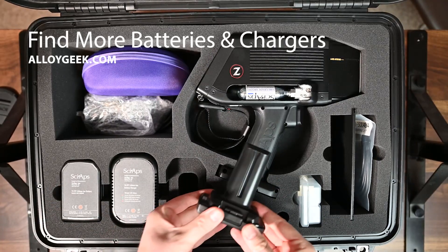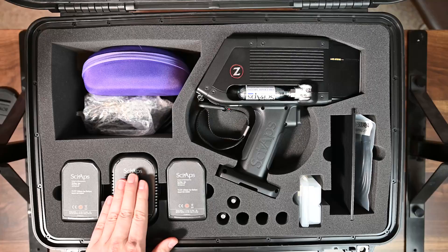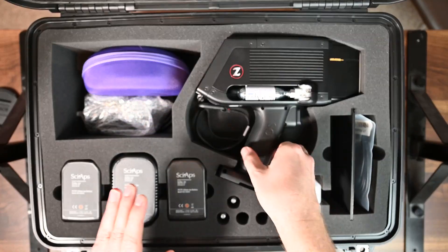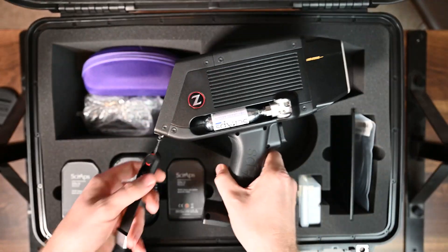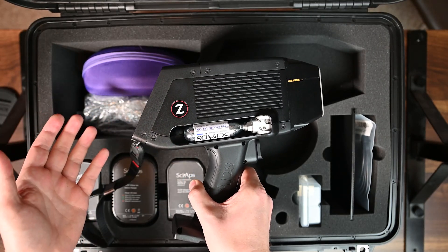We have two batteries here — these batteries just clip right into the bottom of the unit just like that — and we have our battery charger in the middle. Now let's first take a look at the SciAps Z902 unit. I've really liked the LIBS units from SciAps; they have a very nice sleek design and the black makes it a pretty sexy little unit.